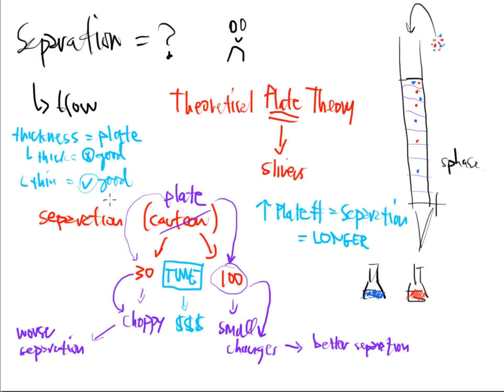And in a flip book, thin pages work so much better because you're flipping through them one by one, and it's basically allowing you to see a smoother transition from page to page to page. So this is what we call plate height.